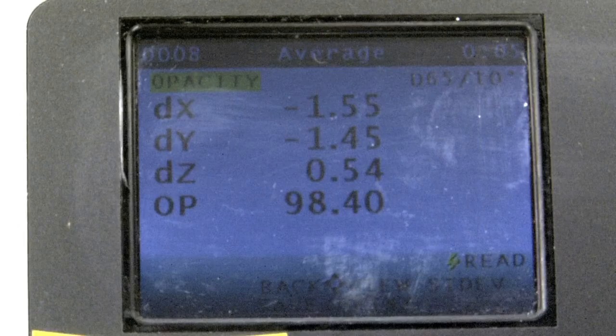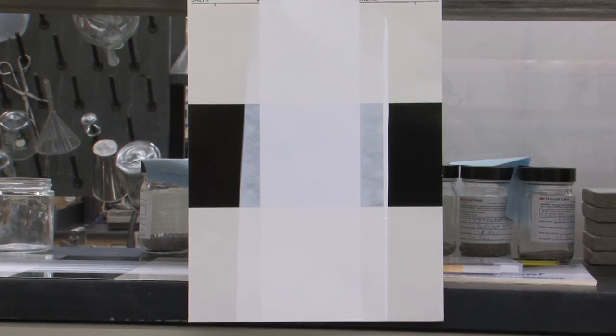This tells us how well the paint hides. This panel is an example of post-drying results for a flat architectural paint formulated with 3M brand ceramic microspheres.